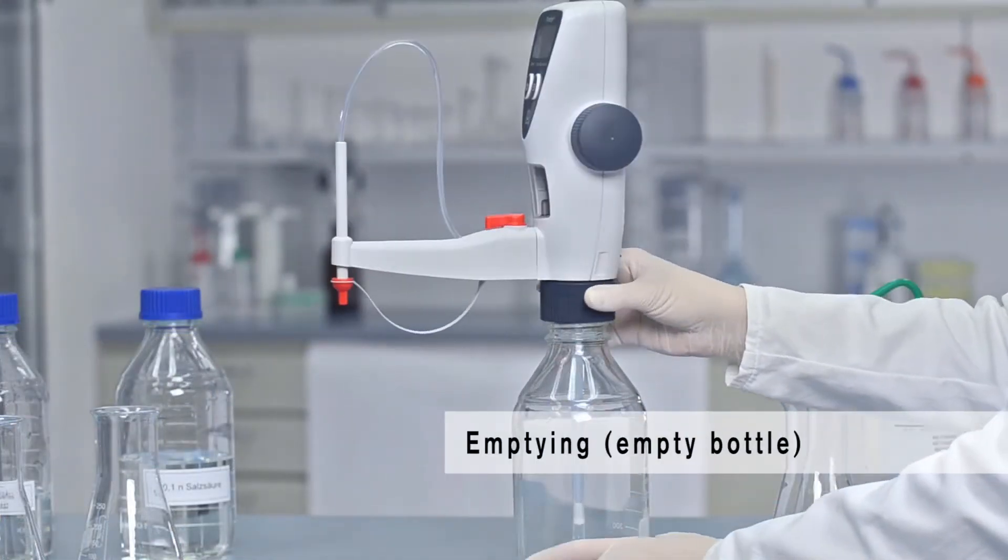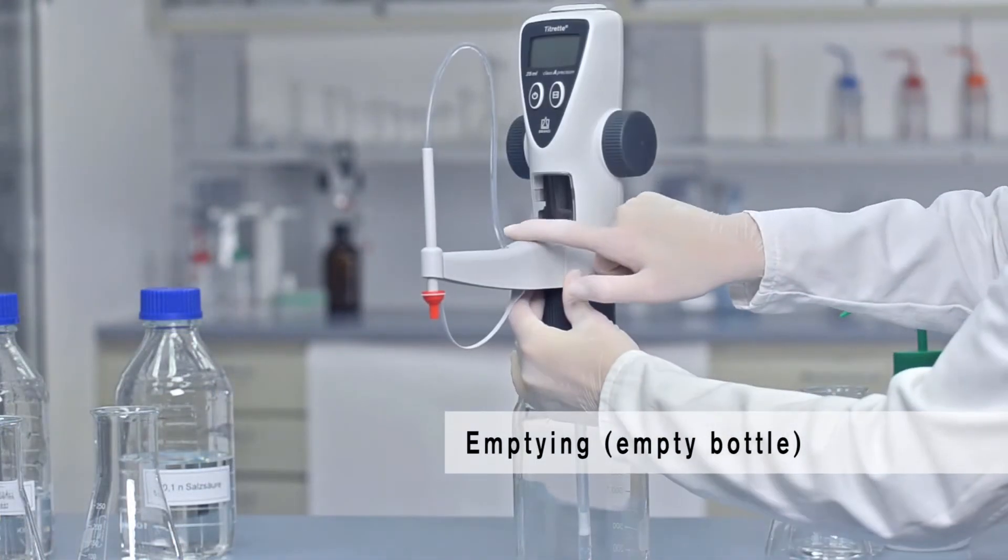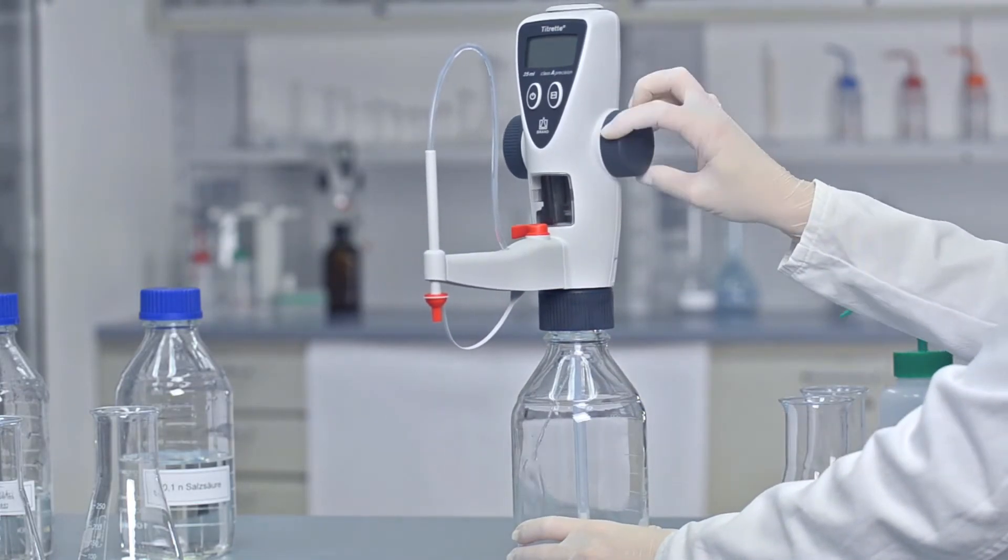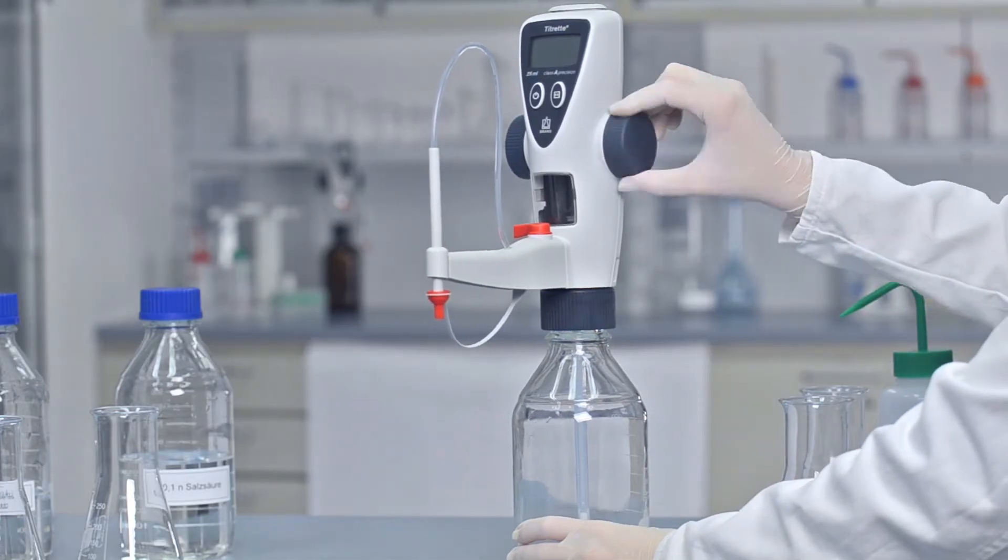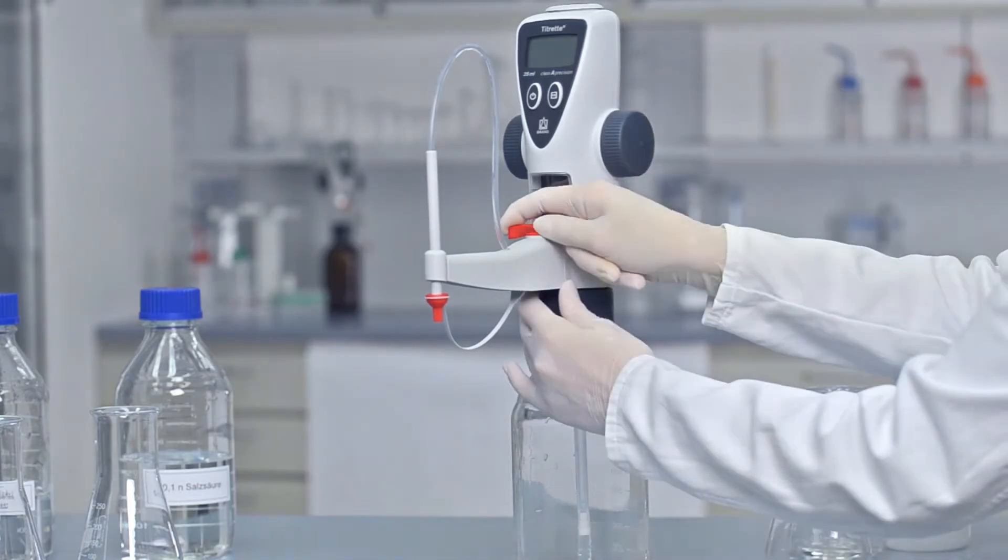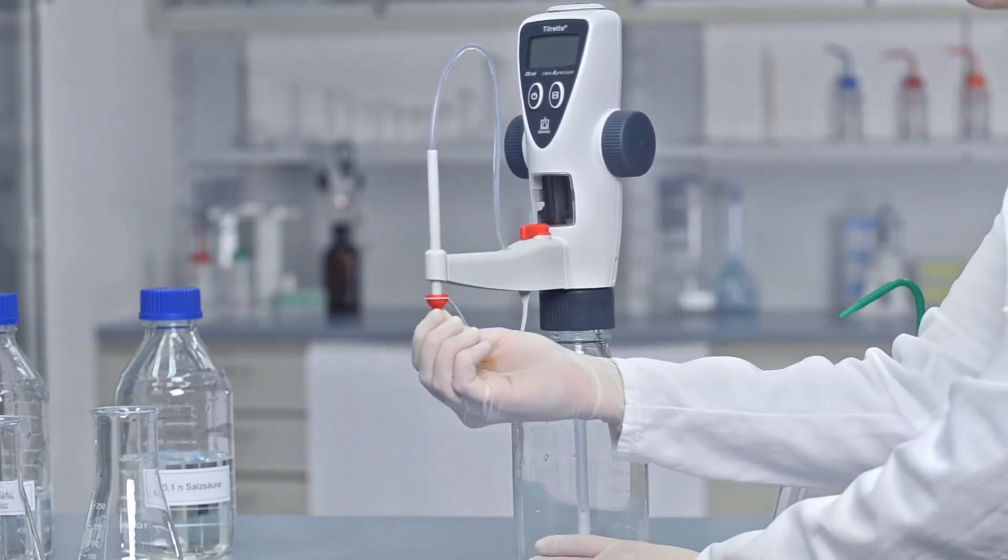Next, attach the Titrette onto an empty bottle and empty the instrument completely. To do this, move the piston up and down several times at both valve settings.